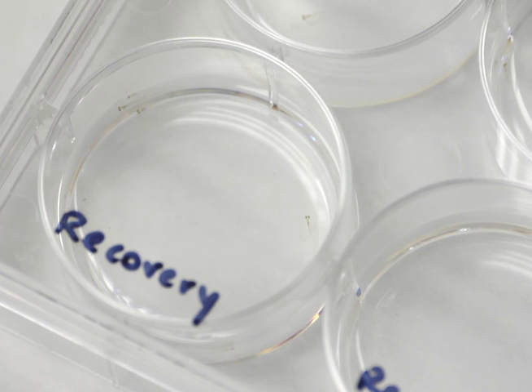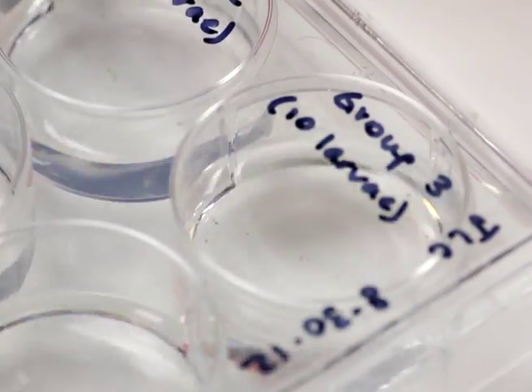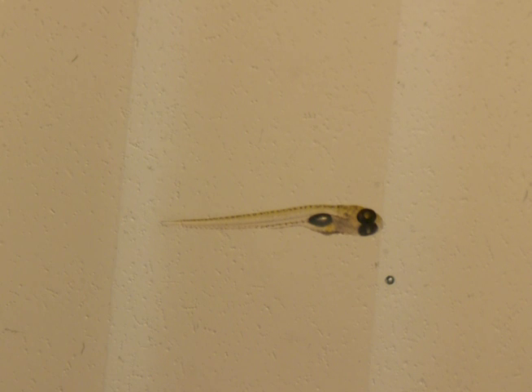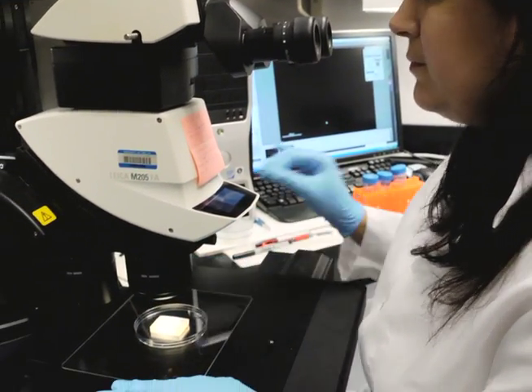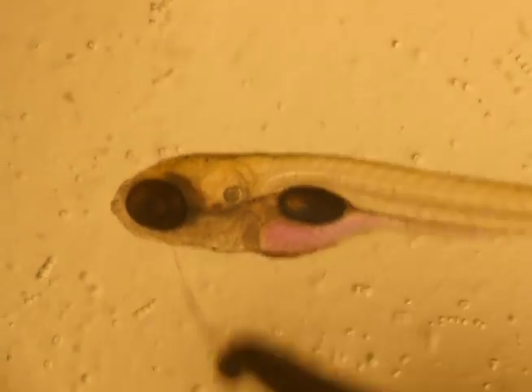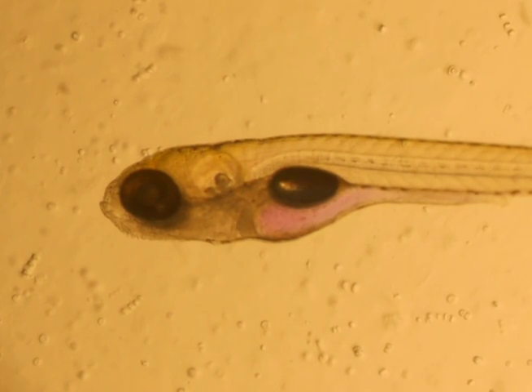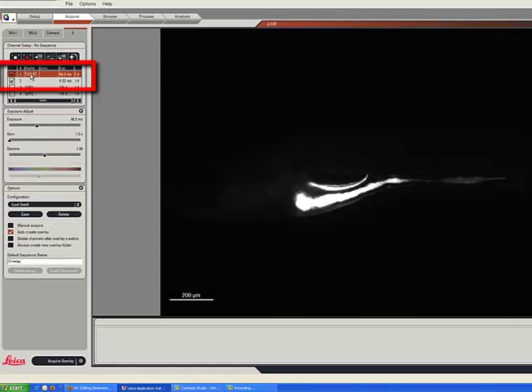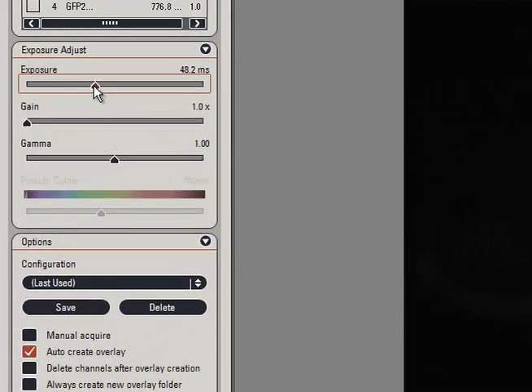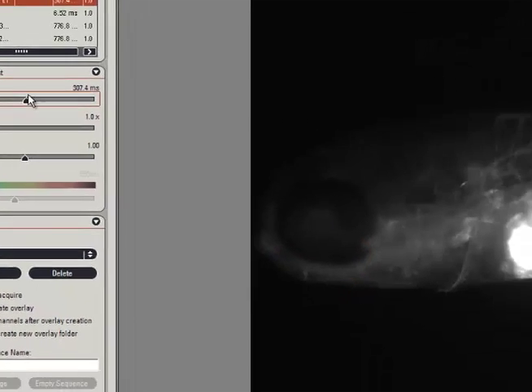After gavage, recover the larvae from anaesthesia and allow them to swim freely in fresh media. After approximately 20 minutes, re-anaesthetise the larvae. Once anaesthetised, position the larvae in 3% methylcellulose on top of a 3% agarose block. Image the larvae with a fluorescent stereomicroscope and a Texas Red filter. Select a magnification that displays the larvae from the snout to immediately posterior to the end of the cloaca. The fluorescence should be intense in the intestinal lumen; however, barrier function is evaluated by the level of dextran that appears in extra-intestinal tissues. Adjust the exposure to enable visualisation of trunk fluorescence even if this overexposes luminal fluorescence.